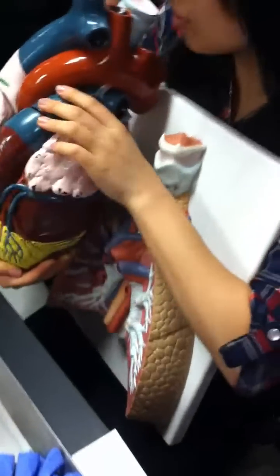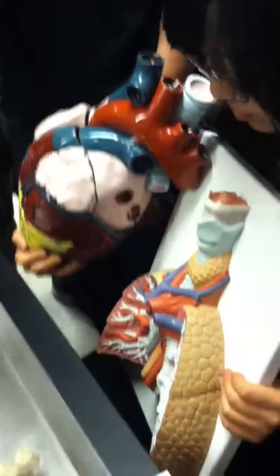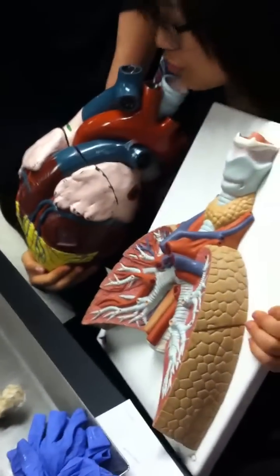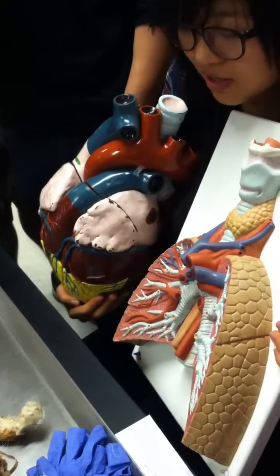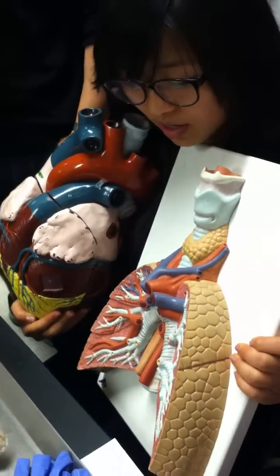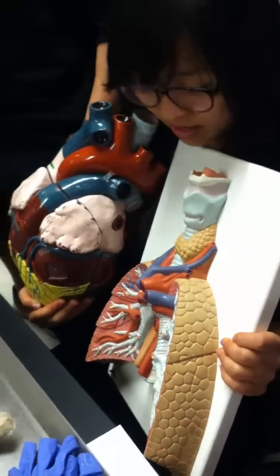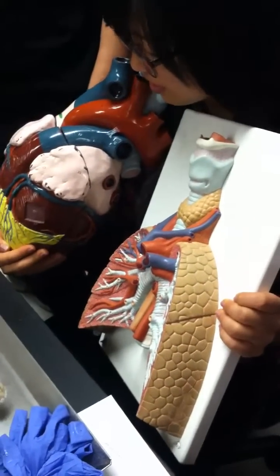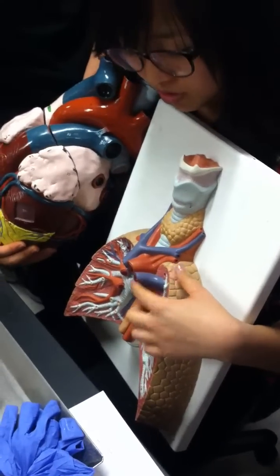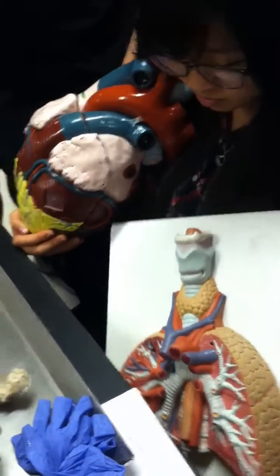Do you see how this right here corresponds to this right here? Do you guys see the 1, 2, 3 and the 1, 2, 3? Right? Superior vena cava, that's this first one right here, this first blue. The middle one is part of the aorta, and then the last one is the what? Pulmonary trunk. Excellent.